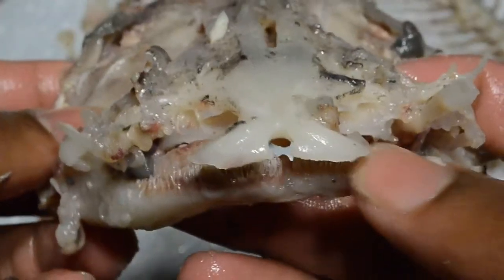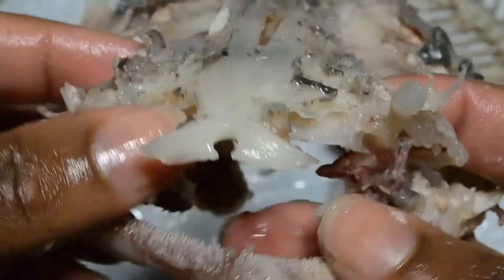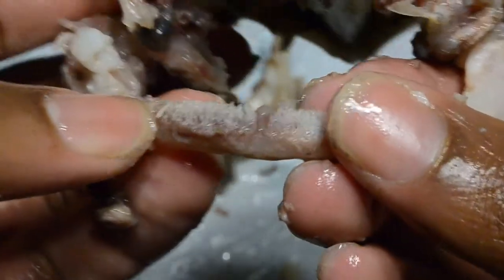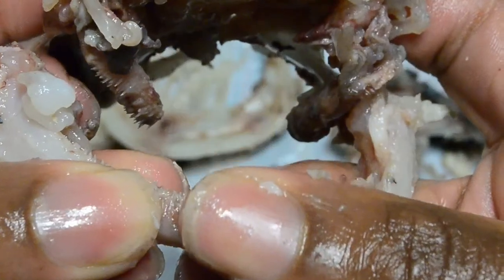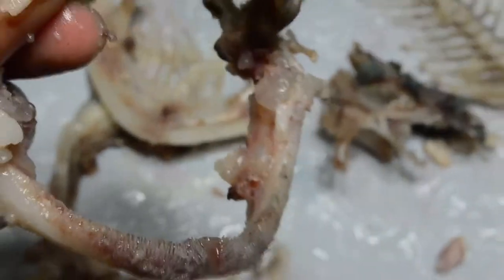We're going to learn some more about these guys because they're really fascinating creatures, so stay tuned. I just can't get over these teeth — even though they're not sharp and they don't hurt, there are just so many of them. They really grip into my skin. If my whole hand was in there, I wouldn't be able to pull it out.